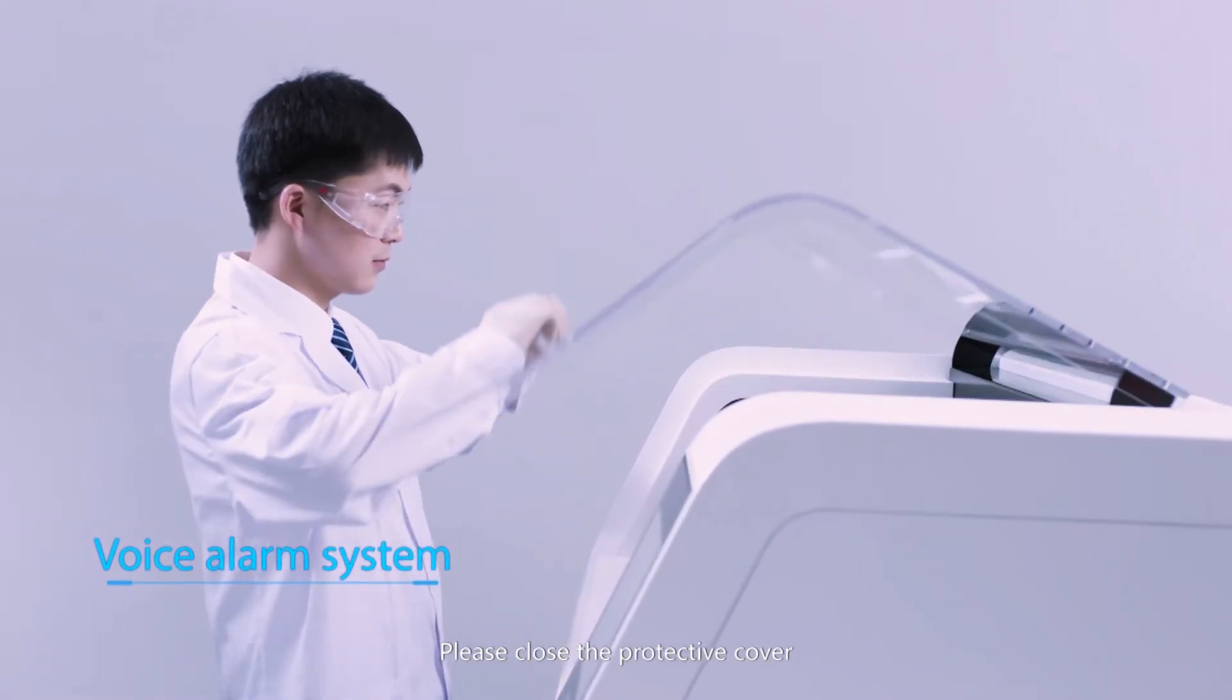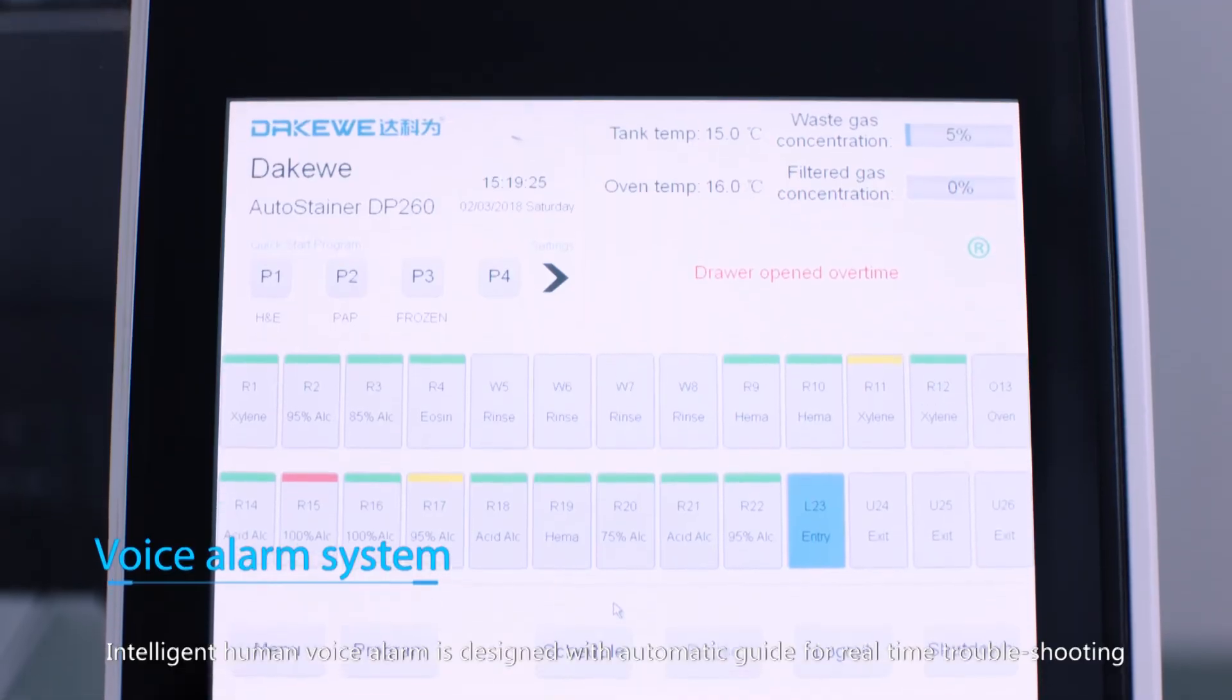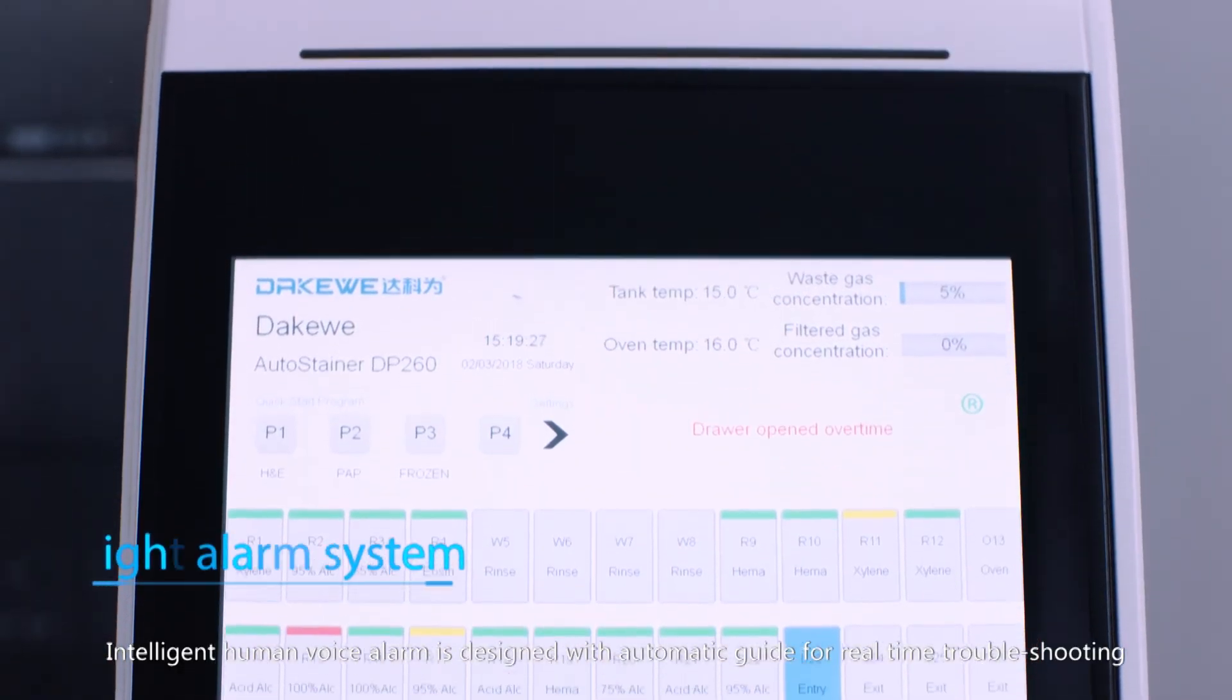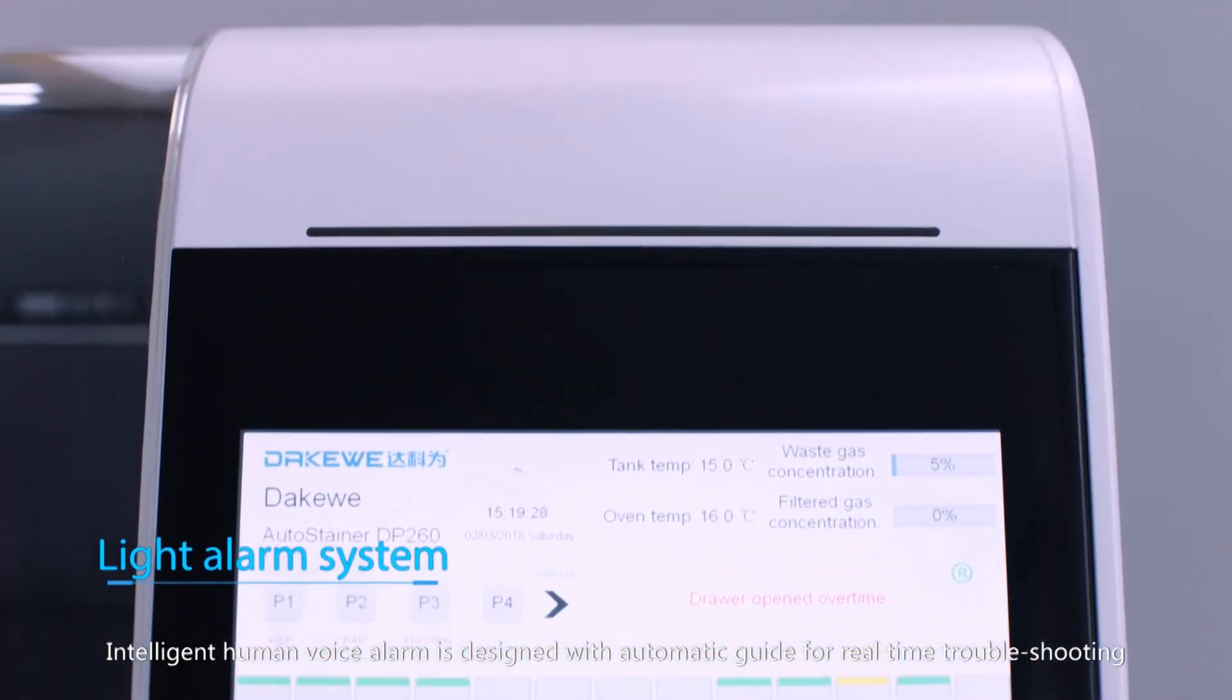Please close the protective cover. Intelligent human voice alarm is designed with automatic guide for real time troubleshooting.